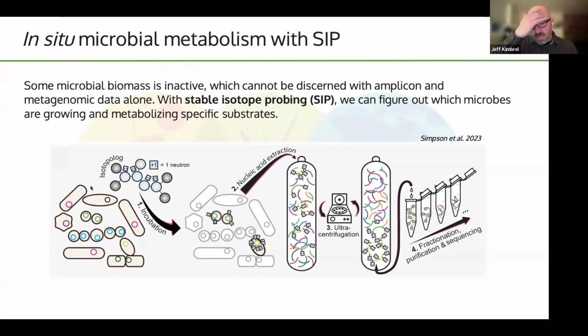And you guys, I'm not sure if you can see my mouse, but I'll assume you can. So this is just a schematic from an upcoming paper that we have that's currently on bioRxiv that details SIP, qSIP, and generally these standards that we're trying to develop called MISIP. So you'll hear the term MISIP for minimal information about a stable isotope probing experiment.